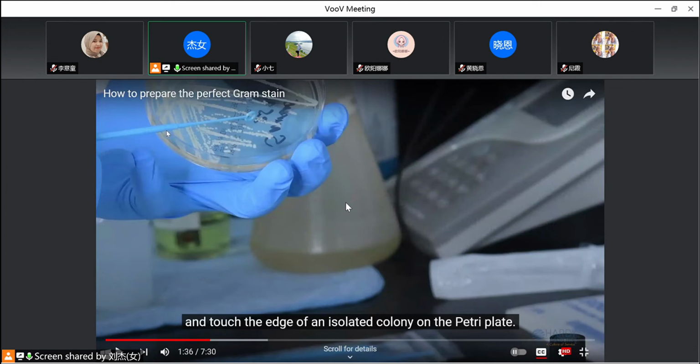You need to use a clean tool to get some sample. Only a few, not too much, only a few of the sample. And do not use the cotton stick, because the cotton stick has some fibers of cotton, and the fibers of the cotton can attach to the slide in the saline, the water, the fluid.